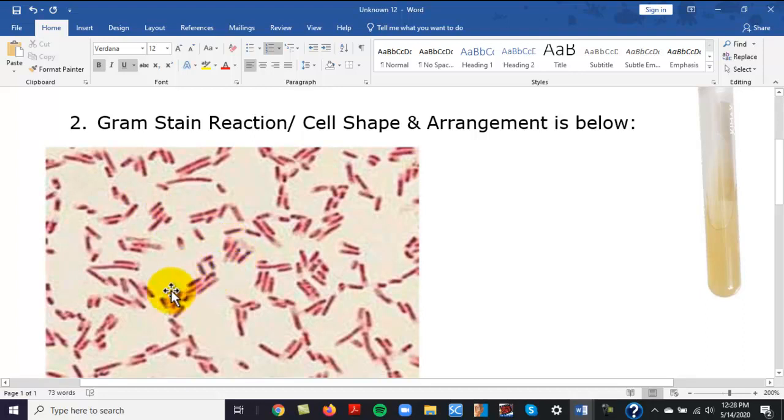That looks a little bit like that actually. And look how they're all stacked. And then so, look, you can see the majority are. So this would be palisading, definitely. Or pelicides, even. If you were to put that these were also in singles, you would have got credit for that as well. Look, go with the majority.